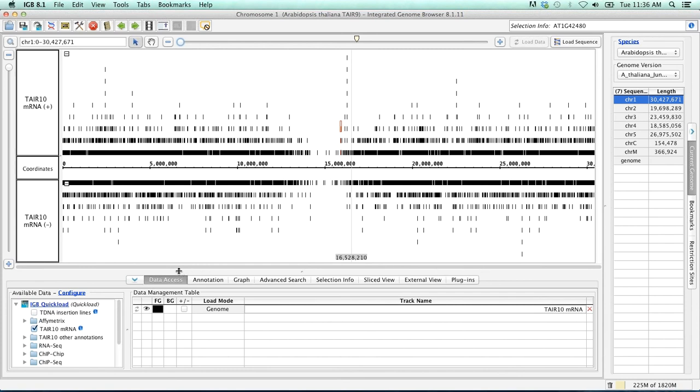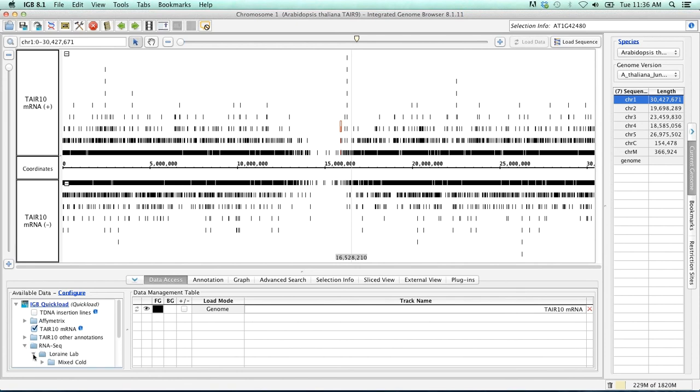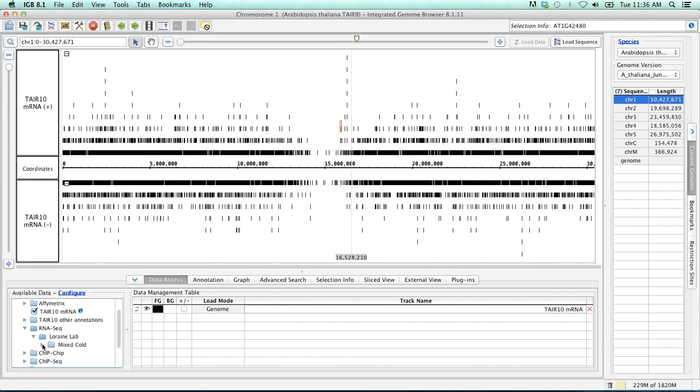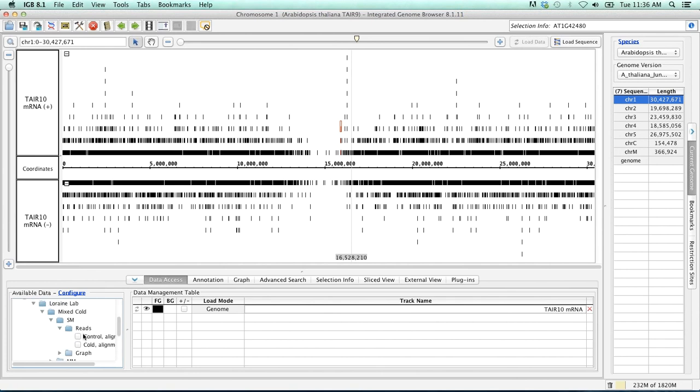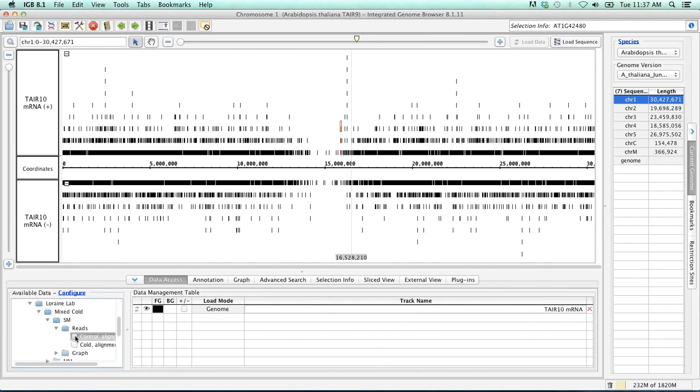In the data access tab, go to the available data. You'll see here that we have IGBE quick load. Go to the RNA-seq, Lurian lab, mixed cold, SM for single maps, reads, and what we're going to load is the control and cold alignments.